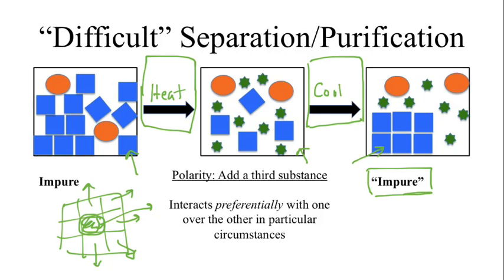Okay, and ideally the solvent that I've picked will only dissolve my compound when I've added heat. So what happens when I cool it down? Now it starts to say, well, I don't want to be dissolved anymore, so it starts to crystallize and in theory not precipitate, but crystallize out of solution and form solid.